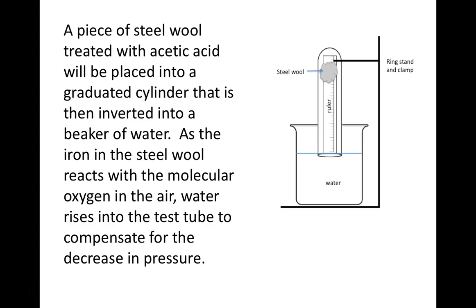If you notice on the outside, where it's open, the water surface is exposed to atmospheric pressure. That exerts a pressure on the water, which exerts a pressure inside the graduated cylinder that'll eventually hit equilibrium. So the inside of the cylinder will be at 1 atmosphere of pressure. What this does is force water up into the inverted graduated cylinder.